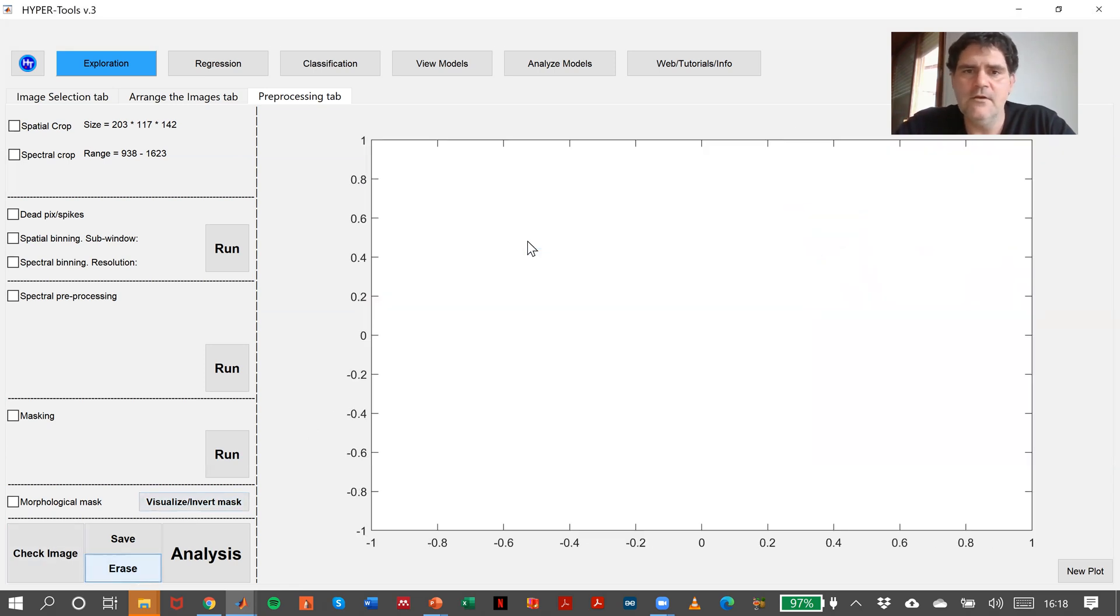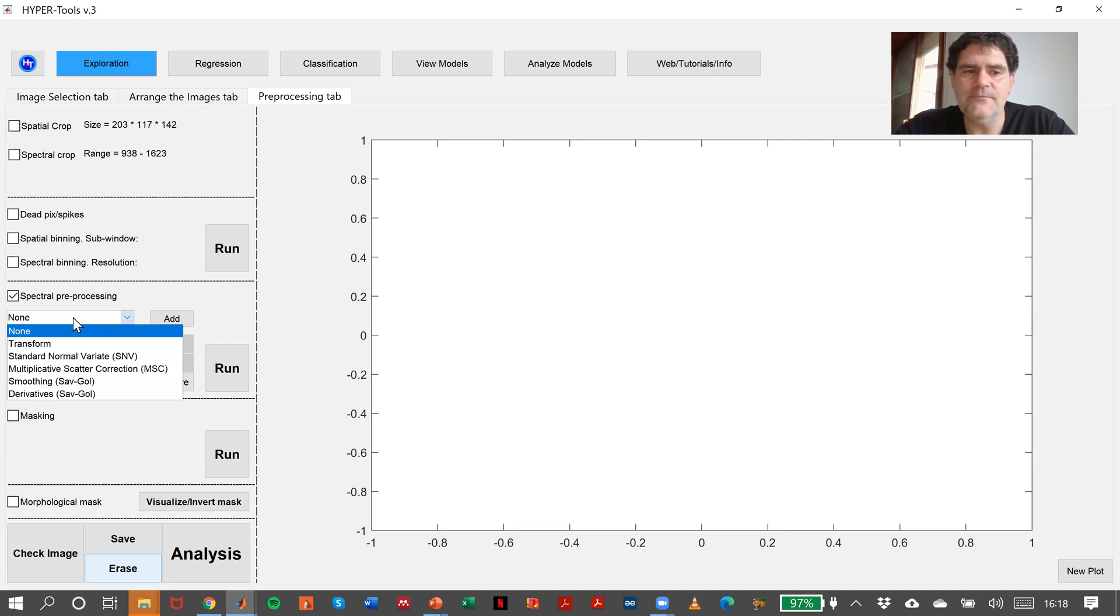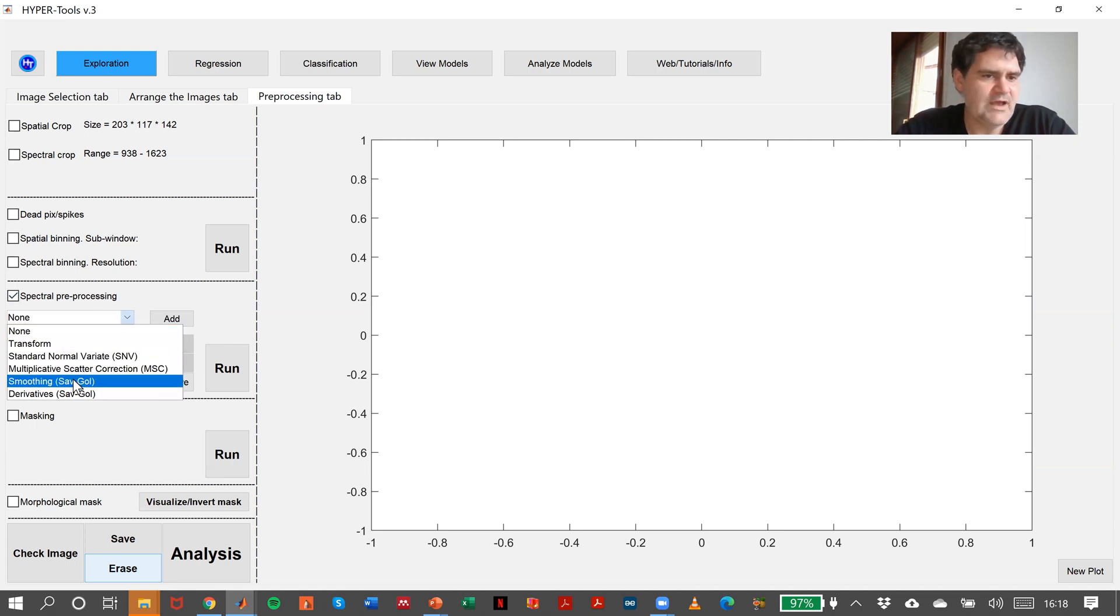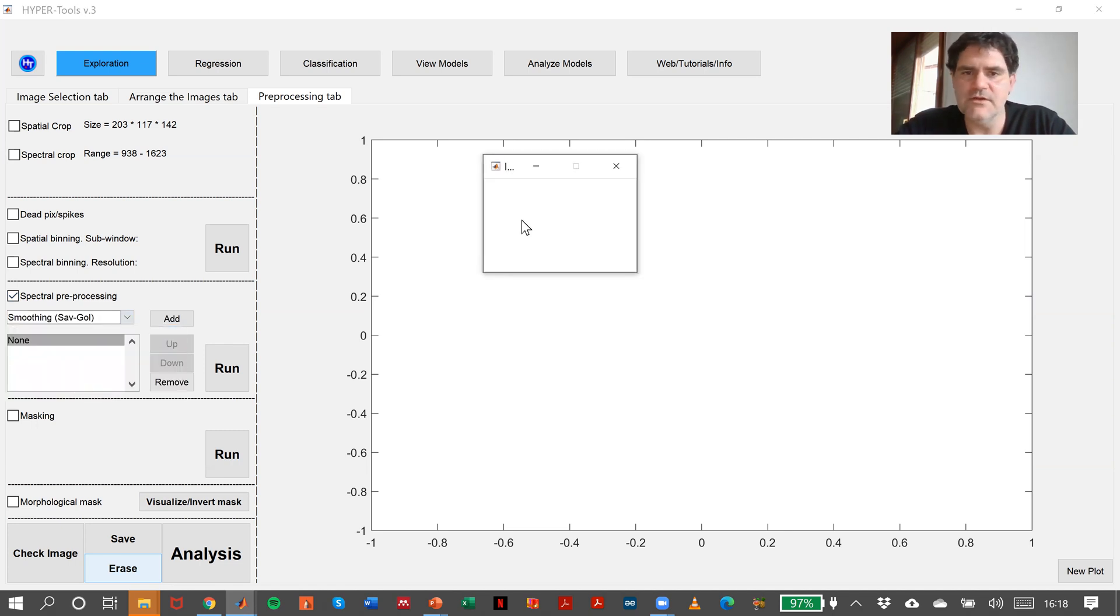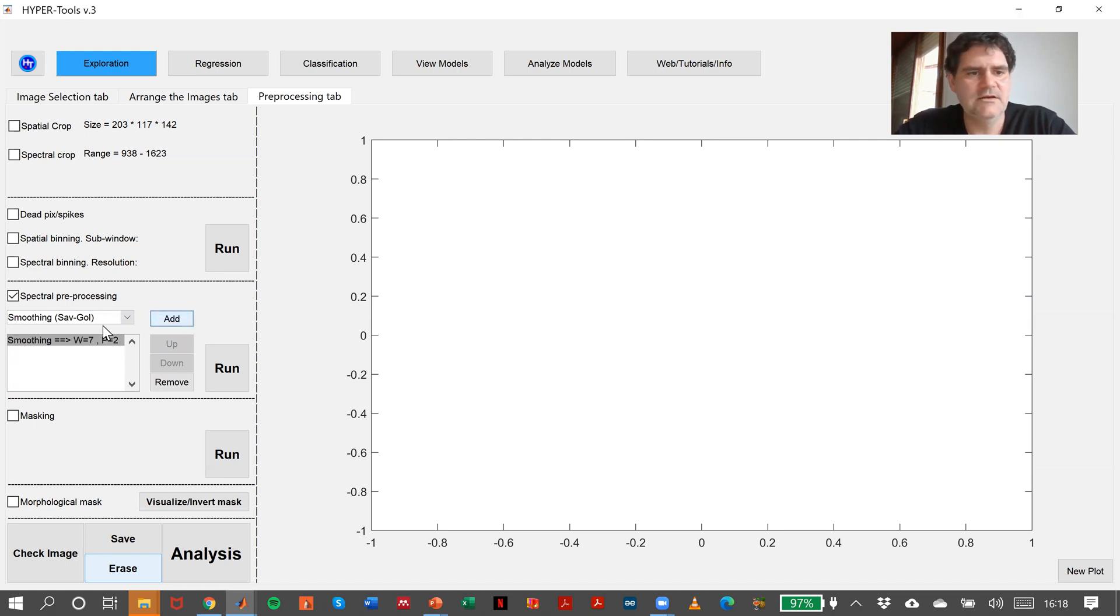But look how things change when, for instance, I make a spectral preprocessing method before. Like a little bit of smoothing, seven points, and a standard normal variate. This is the data.